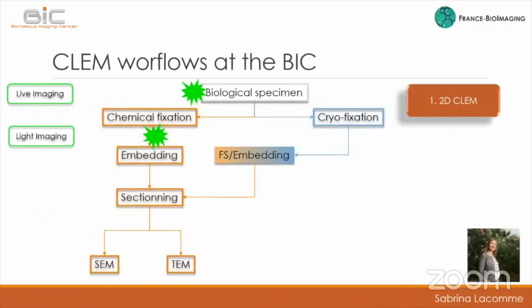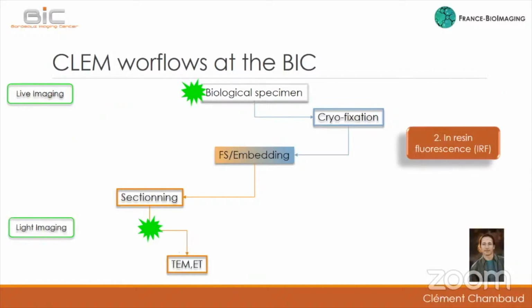At the Bordeaux Imaging Center, we will be talking about the different protocols we have available for the users. Sabrina Lacomme will be presenting the classical CLEM preparation for 2D, which uses light microscopy to find the region of interest, and then sample preparation to observe either in scanning electron microscopy or transmission electron microscopy. And she has different protocols to share with you.